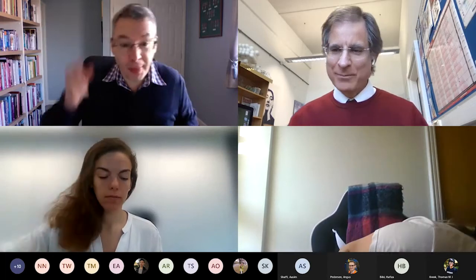And I'll hand over to you and let you take the session from here. Okay, well, thanks very much, Stephen, and thank you to everyone who's come along. I should just start off by saying that I'm not exactly a Microsoft Teams expert, so if you see me fumbling slightly, that'll be why. But what I'm going to do is start off by trying to give a brief introduction to our software to get you started. And as Stephen said, there will be a second half where we can do slightly more interesting and interactive things. So let's have a go at sharing my screen.